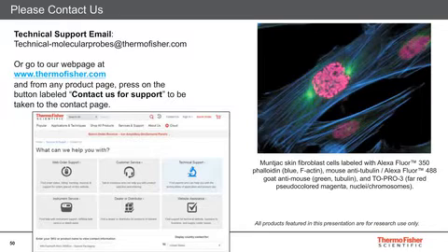Well, when you look at an EVOS microscope, the first thing you notice is there's no eyepieces. You're looking at a screen. All of them use monitors.